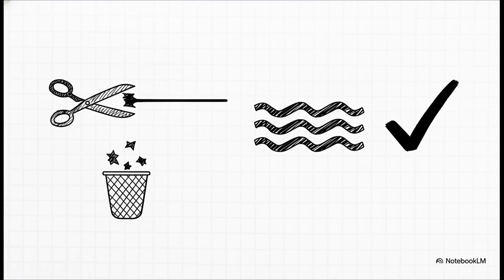But before we can actually analyze this data, we've got to clean it up. We do this in a pre-processing phase using quality control tools like FastQC.